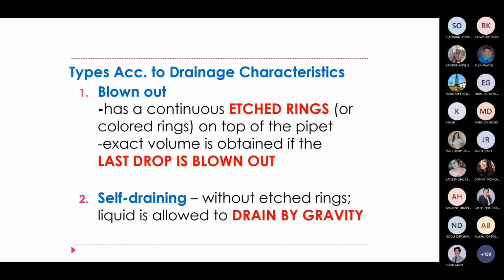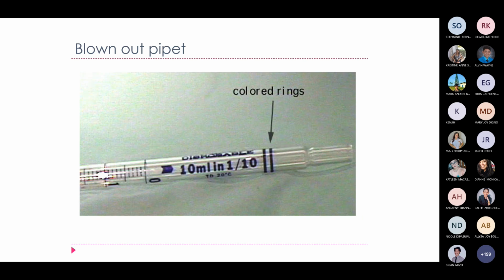Okay, sana natatandaan n'yo. Next, yan na, si H. Yan si H. Again, kapag may H, blown out pipette.